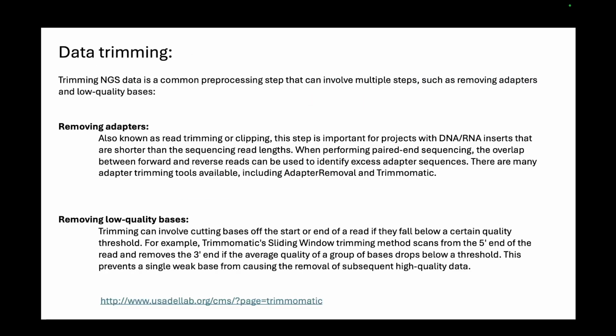After that, as you know, when you're sequencing the data, there were adapters getting attached to the ends, the 3' and the 5'. And if you remember the Illumina video, what can happen is when you're sequencing, the adapters might still be on your strand, and while sequencing, this adapter is also sequenced. So what you get is extra data, but that data is not originating from your sample. That data is coming from extra stretches of adapter that are present while you are sequencing. So it's a good idea to always remove these adapters.